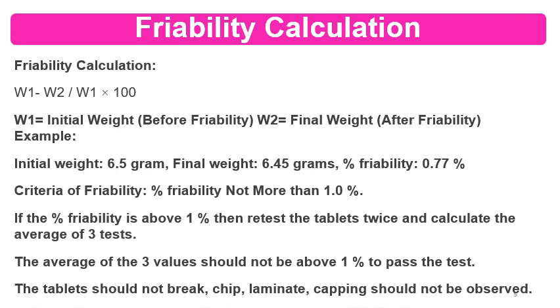Because if capping is there, there are high chances that it will lead to problems in further handling and in transportation.